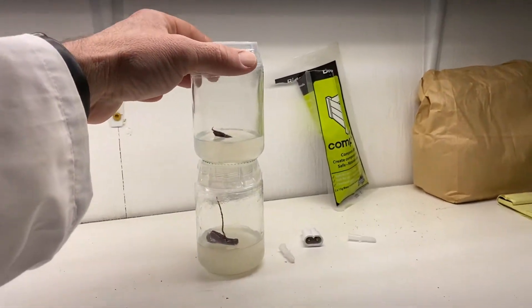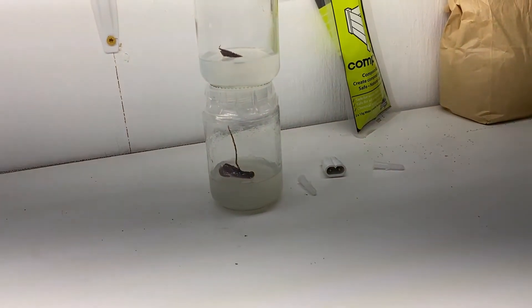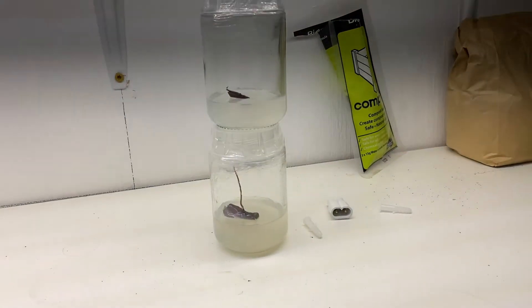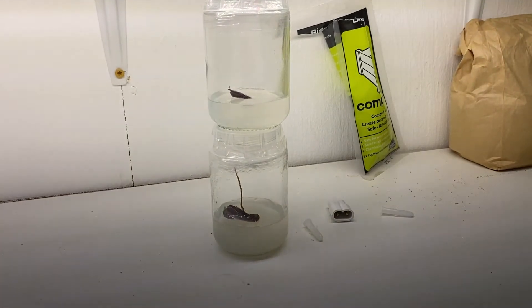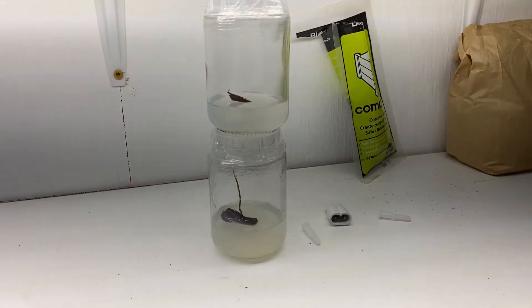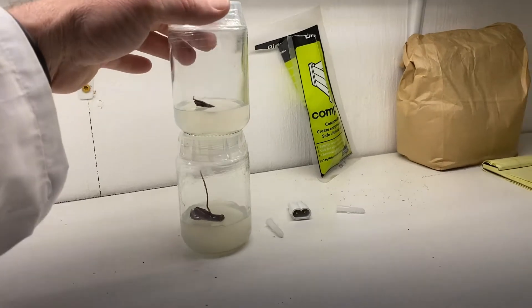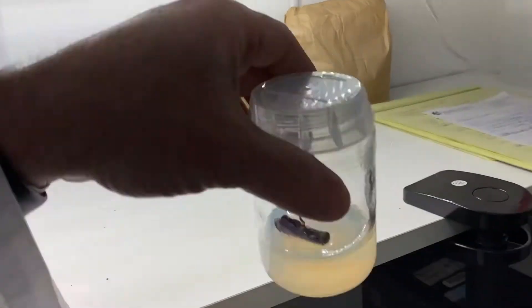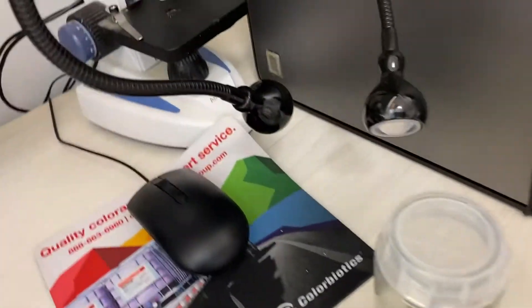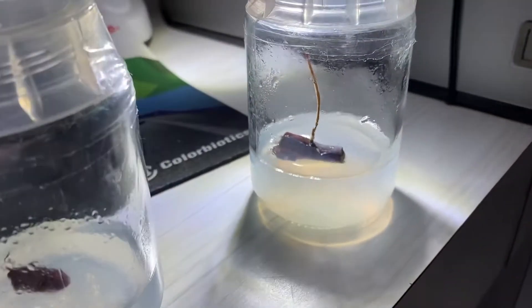We have to move it, Cam, because look at the screen — remember that black thing that moves across? Isn't that weird? Maybe if anybody watching knows why it's doing that — it's a grow light and you can't see it with the naked eye, but that black line on film keeps scooting across the screen. So we're going to move them down here where we can see them just a little bit better. These lights don't do it, just the grow light.